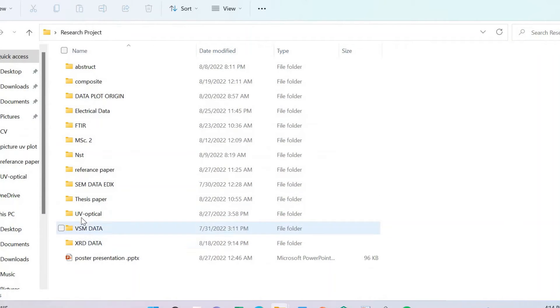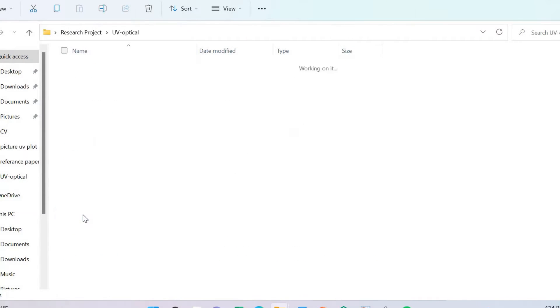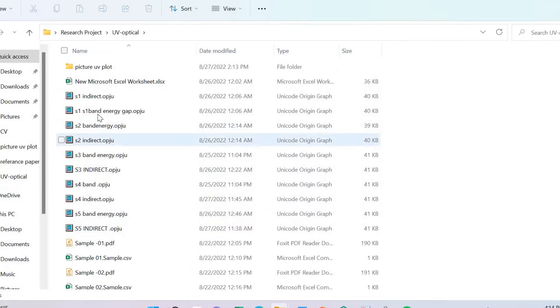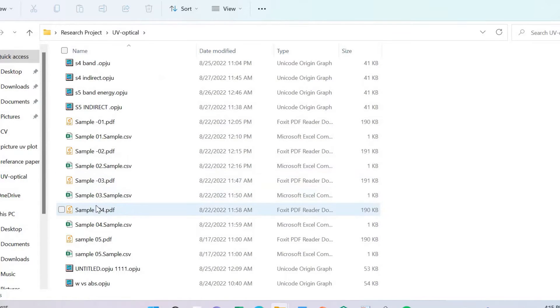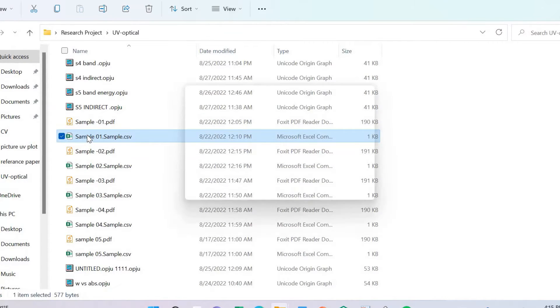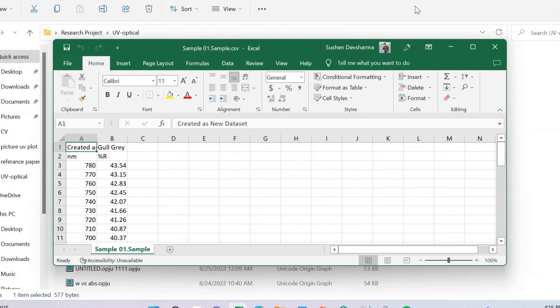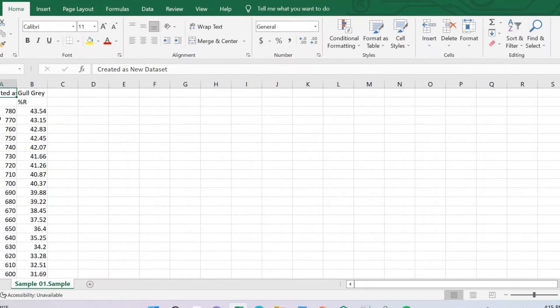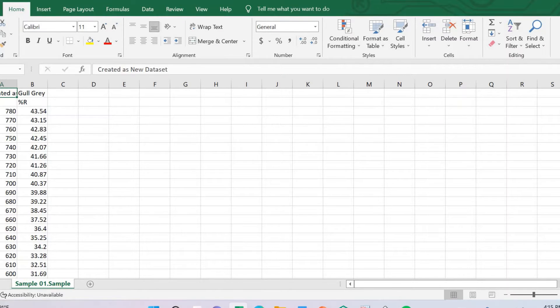Here is my data file of UV spectra. Now I can show you how to plot this data. This is my data — this is wavelength and this is reflectance.